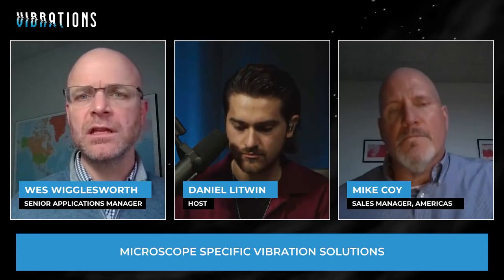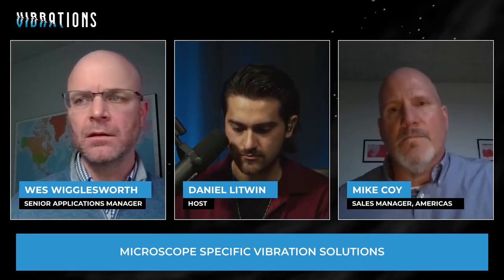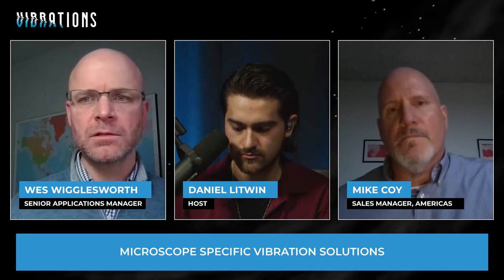So you really want to be considering environmental solutions at the design phase or sooner, because you might design your facility differently to accommodate, say, a platform to support a large TEM. You might want to build a raised floor in that facility that makes it much easier to install a vibration isolation platform. And then there are different approaches as well in terms of supporting the large TEMs. But really, the sooner the better, not only for budget reasons, but for design reasons related to the facility.